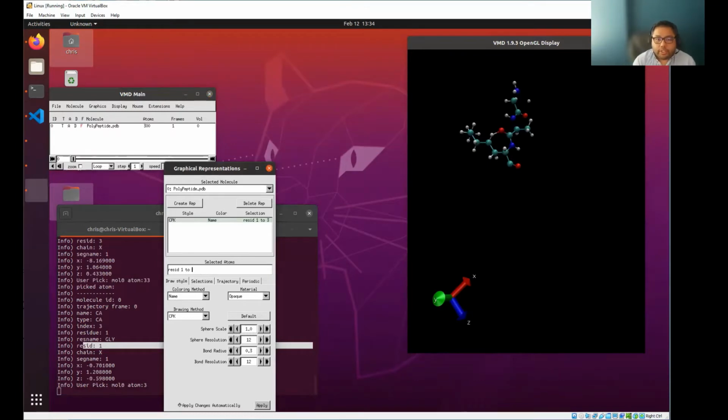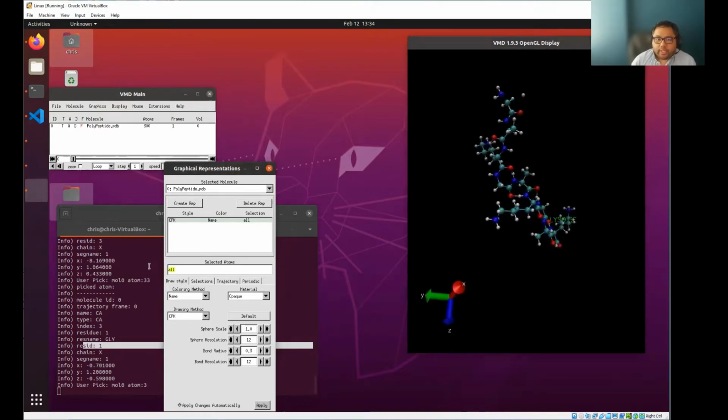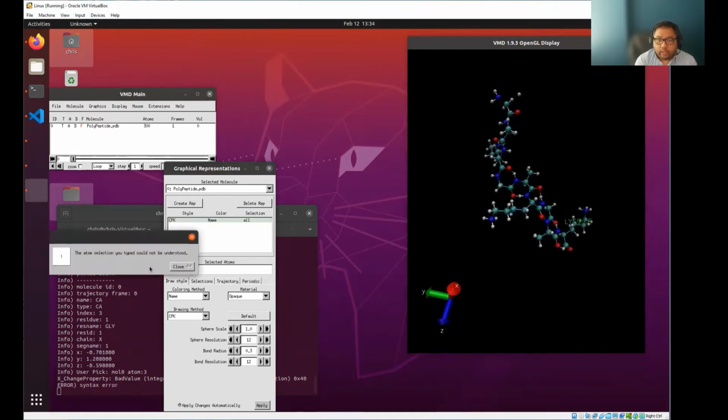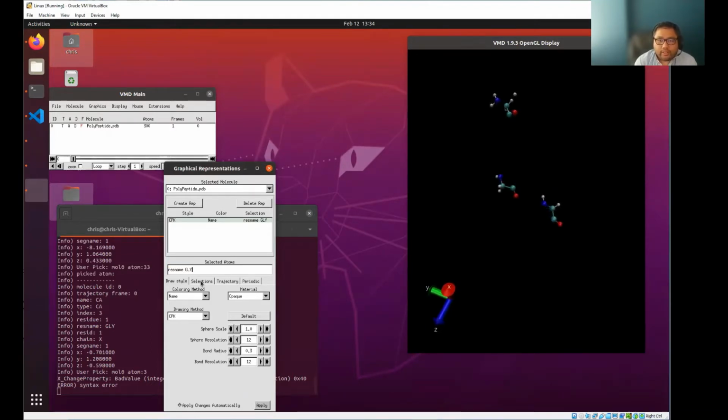So we could show it all, and then we could obviously go back and show the entire thing again. But as I said, I made it into 3 different amino acids in a continuing chain like that. So say maybe I want to see only the glycines in it. I could just tell it, I want to see just the gly. Oh, sorry, resname gly. And it'll show you just the glycines that are along that chain.